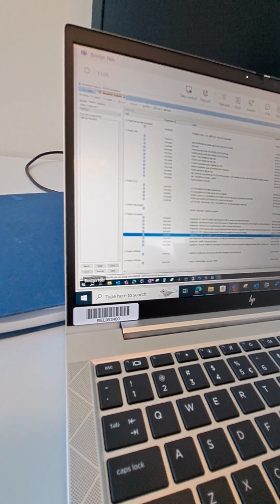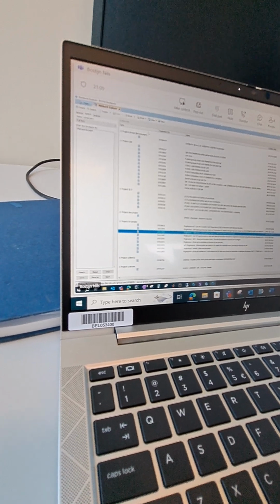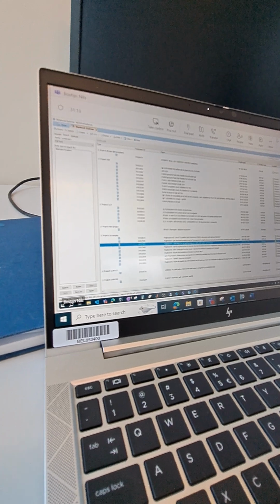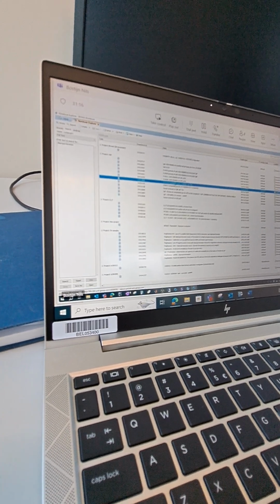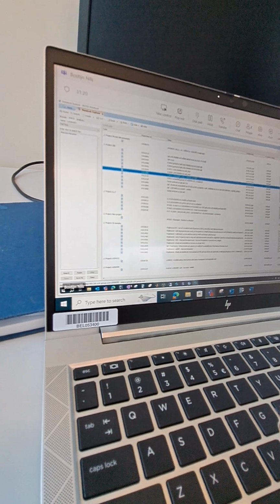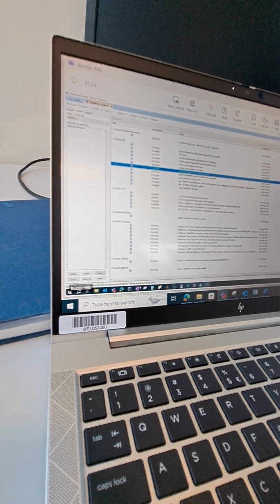But with this I would be careful in terms of confidentiality.